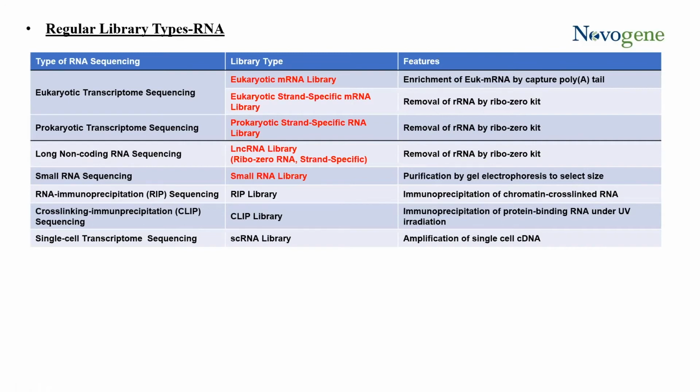So, for example, the strandedness of a eukaryotic library might not be as suited to be loaded on the same lane as a RIP-seq. So it's important to pay attention to how these are being loaded. If you want data output from different library types, something should be considered before just saying, yes, run these libraries on this lane.